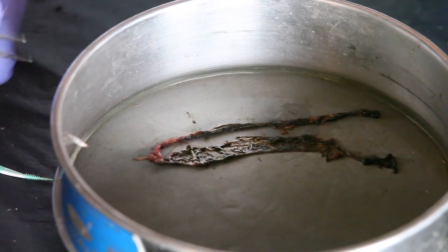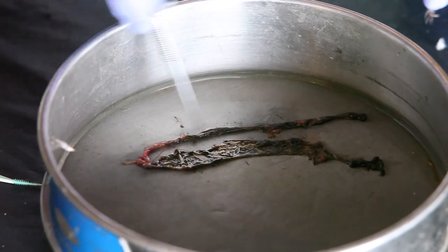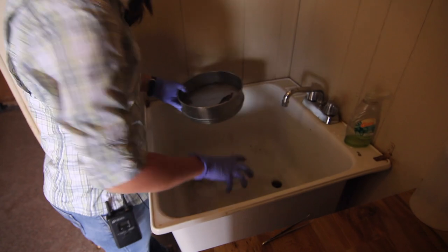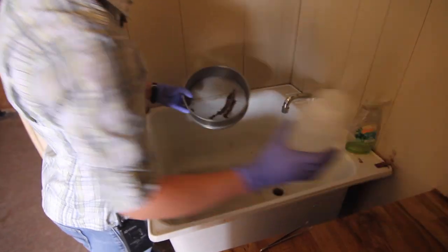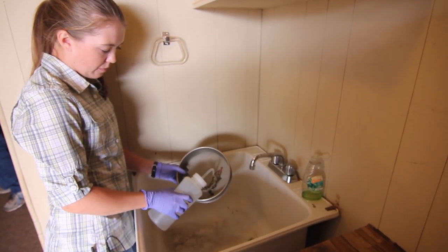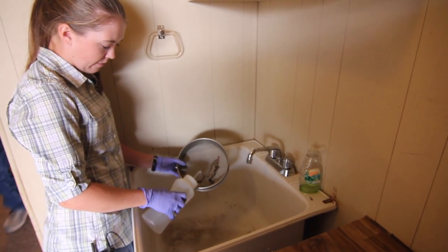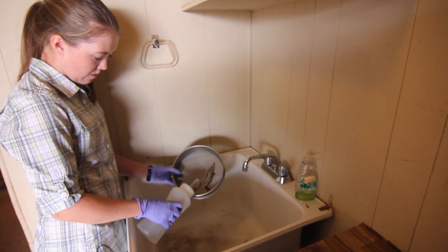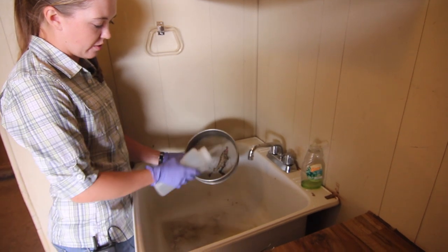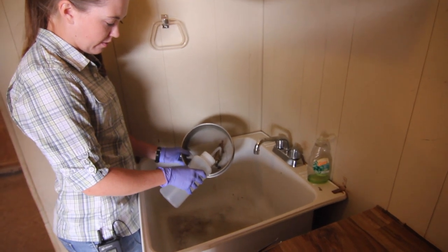So here we can see the difference between this one side that I've opened up and laid out flat, and this other side that's still a tube and is still intact. So the first thing I'm going to do is use my wash bottle and try to clean it out pressure-wise, and try to get all the digesta out this way. I hold it up at this angle so everything washes down, and so all my worms will end up down here. And they'll be easier to get out that way.